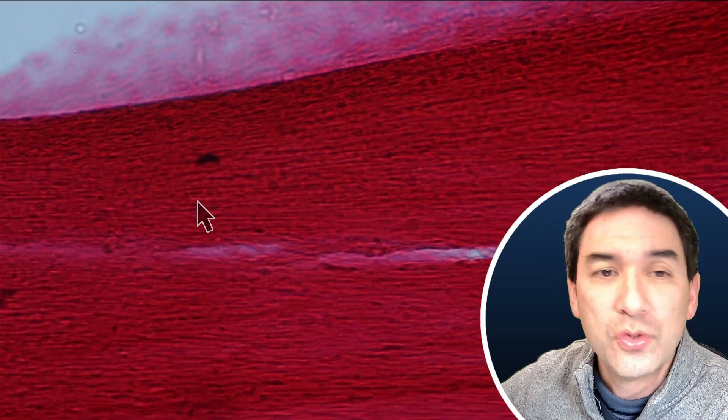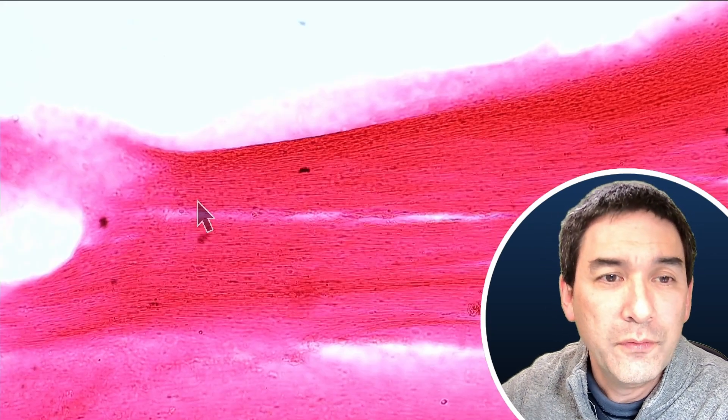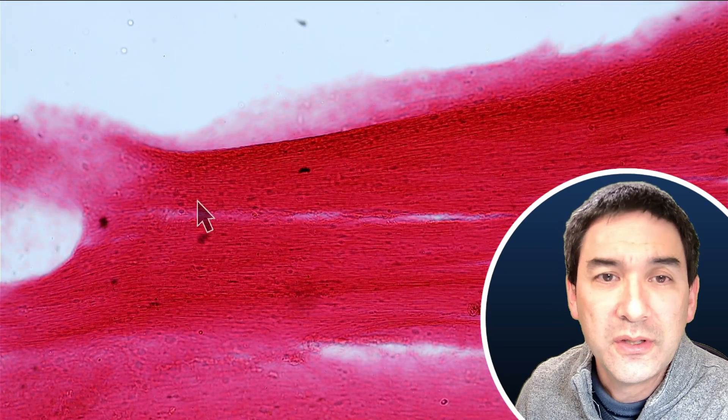Let me zoom out a little bit to give a better overview, going down also a little bit with the light intensity. I'm back here now at 10x magnification, and here we can actually see those tendons much better.